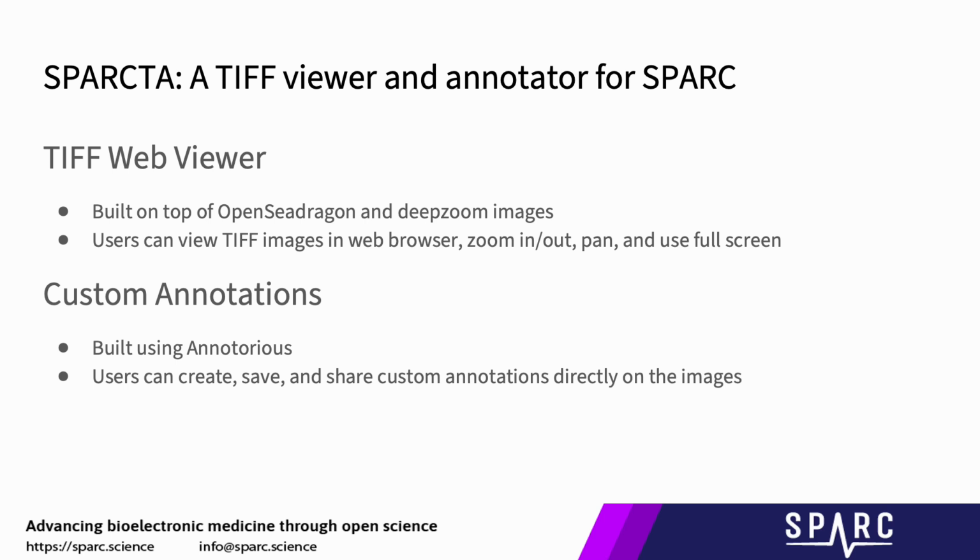It's called SPARCTA. It's a TIFF viewer and also annotator for Spark. The TIFF viewer was built on top of OpenSeadragon and deep zoom images. The reason for this is that we want to preserve the resolution without having the user's browser break because of the files being too large. Using our viewer, users can view the TIFF images, zoom in, zoom out, and use full screen if they want to investigate the image further.